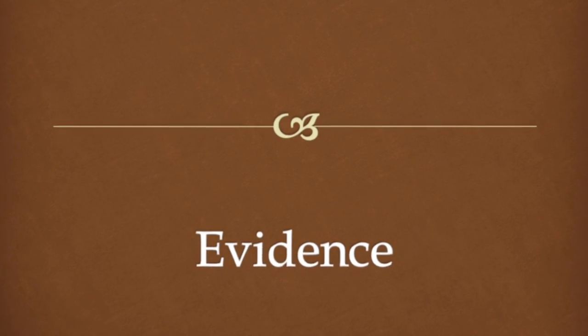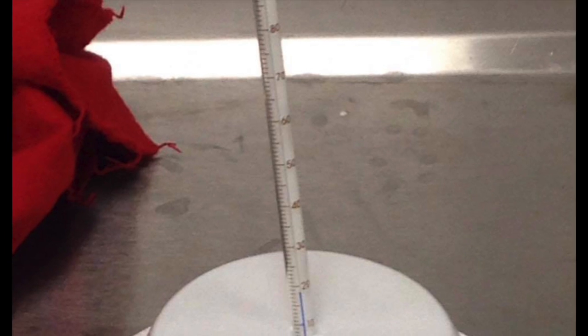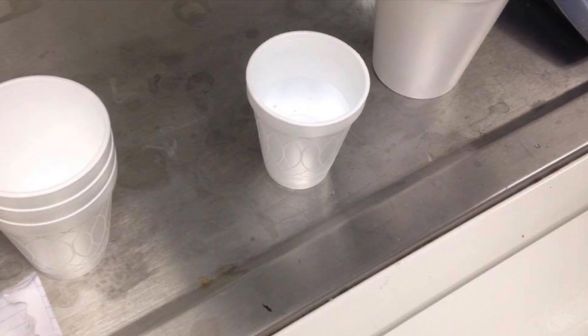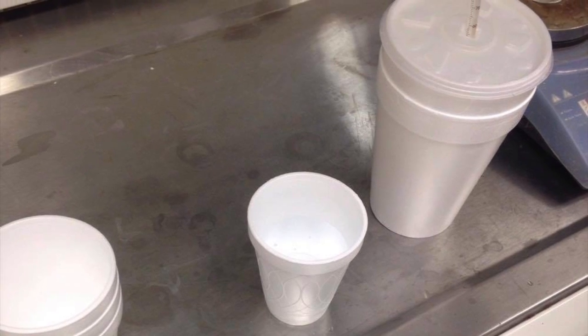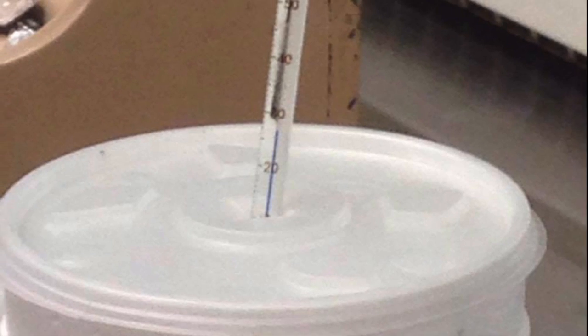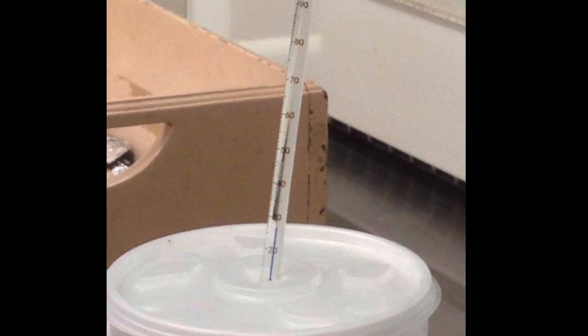was to build a universal calorimeter and determine the heat of an object and the heat capacity of that calorimeter. These two practices were about thermochemistry and how heat works, and also how heat can be transferred from one object to another, as well as the equilibrium between two objects at different temperatures.